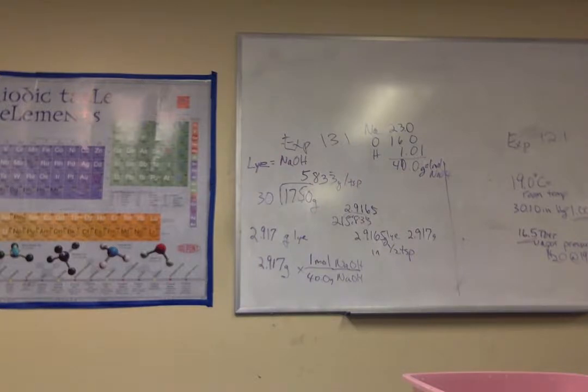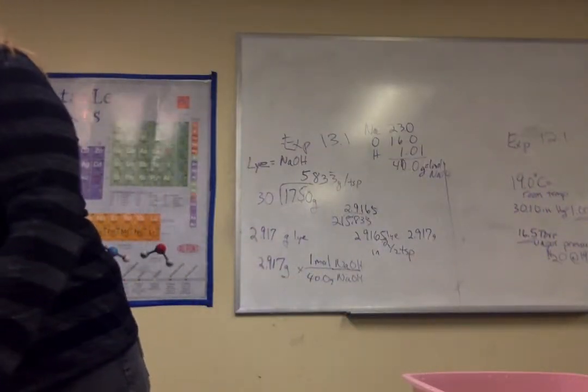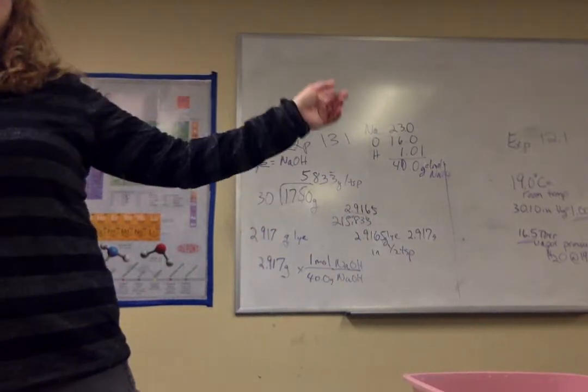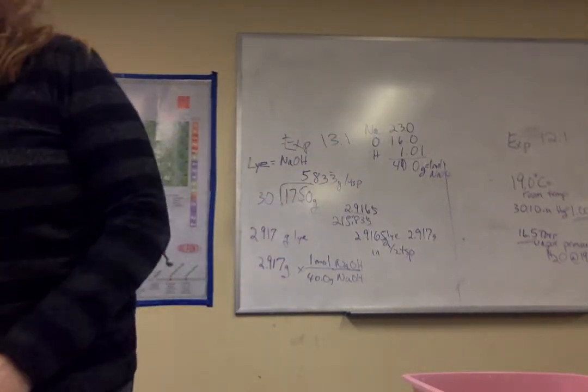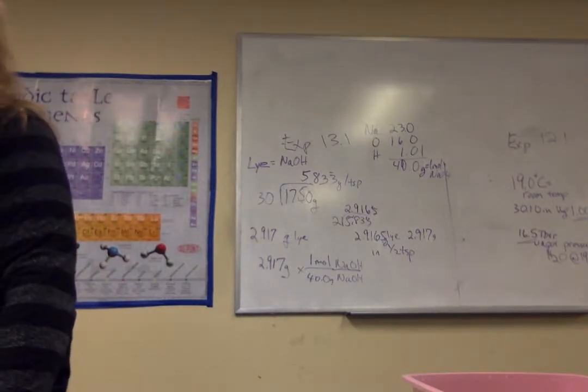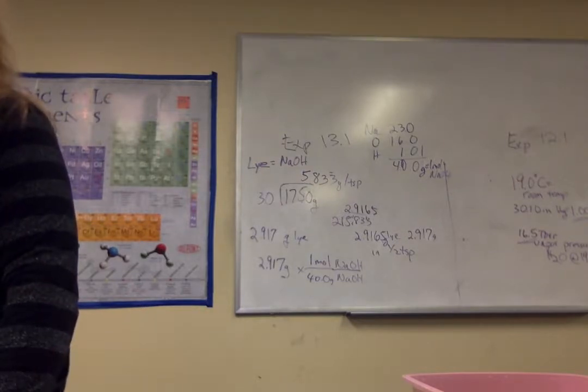Okay, now wait, it's going to be 26.9. Oh, I have to change it. But they said you have to have 2 in a row, right? So that's 26.9. Yeah, but it says if it goes down or stays, pick its highest point. Oh, the highest point? Alright. The 30.3 was the highest point. It stayed twice at 26.9, so I don't know which one you want to do, but it says take the highest point.